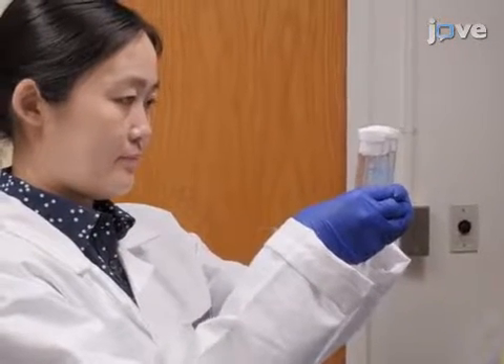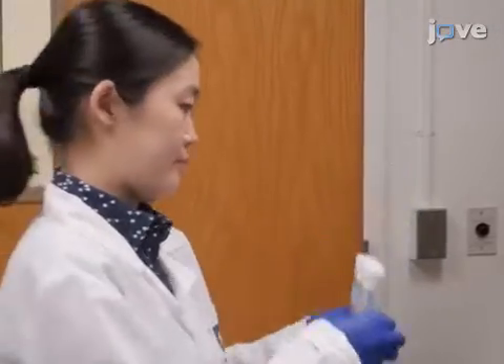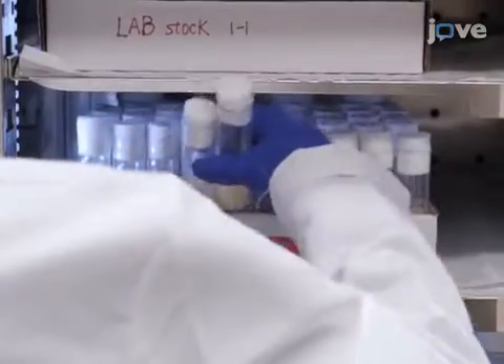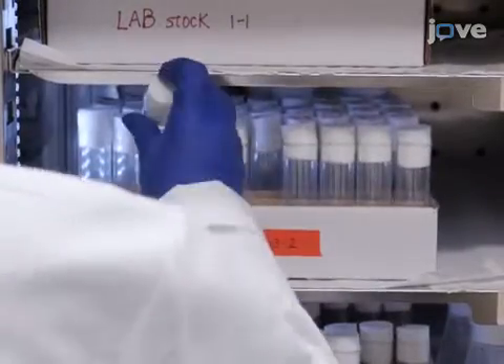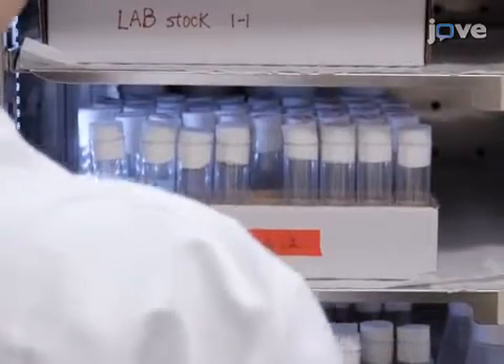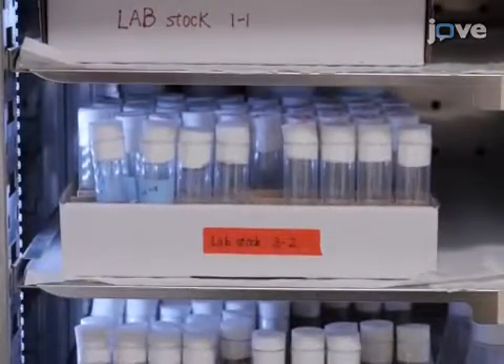To begin the experiment, take a vial with Drosophila medium containing dry yeast and culture 10 adult female flies with 10 adult males at 25 degrees Celsius for two to three days. Ensure flies remain well fed throughout incubation.